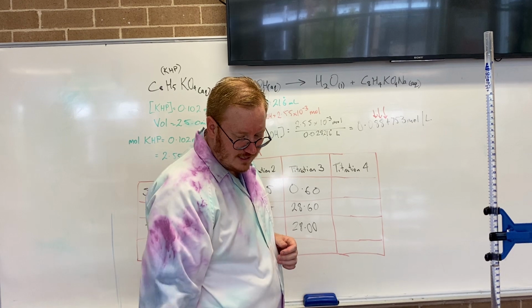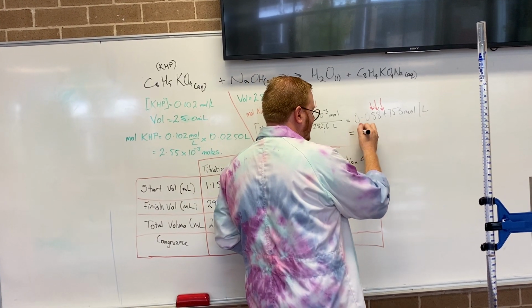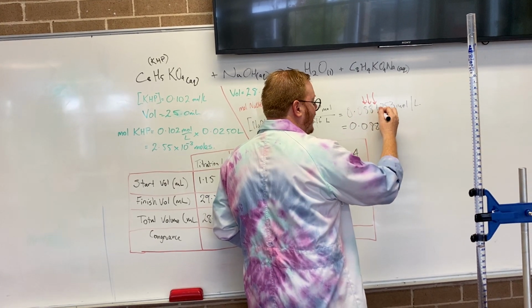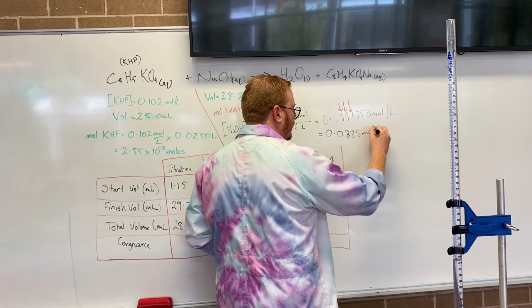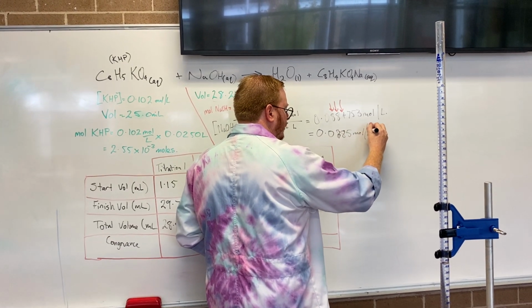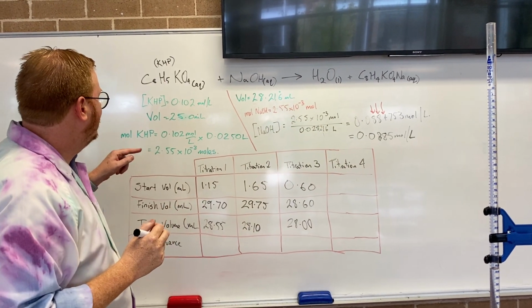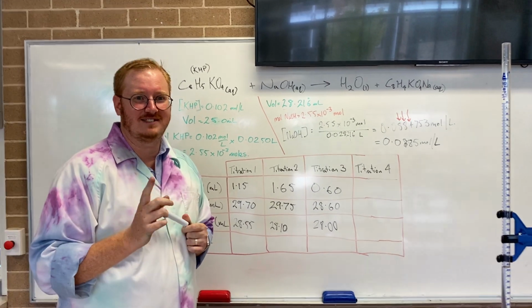Number 4 is larger than 5, so we need to round number 3 up. So it actually equals 0.0885 moles per litre. We know that for sure. Is it near our 0.1 that we assumed it was? It's reasonably close, but let's not pick on Mrs. Dennison.